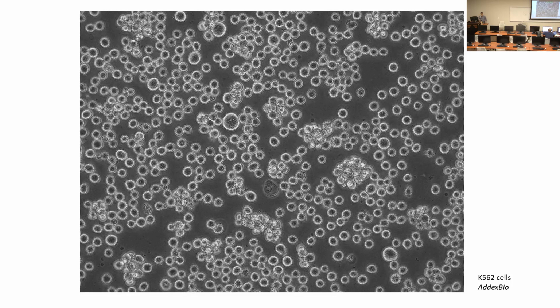And if you look at this group of cells, some genes may be expressed very differently from one cell to another. The fold change could be hundreds. Maybe 90% of cells have no expression of this particular gene, but another 10% of cells express this gene extremely highly. So the question is whether this kind of gene is important.